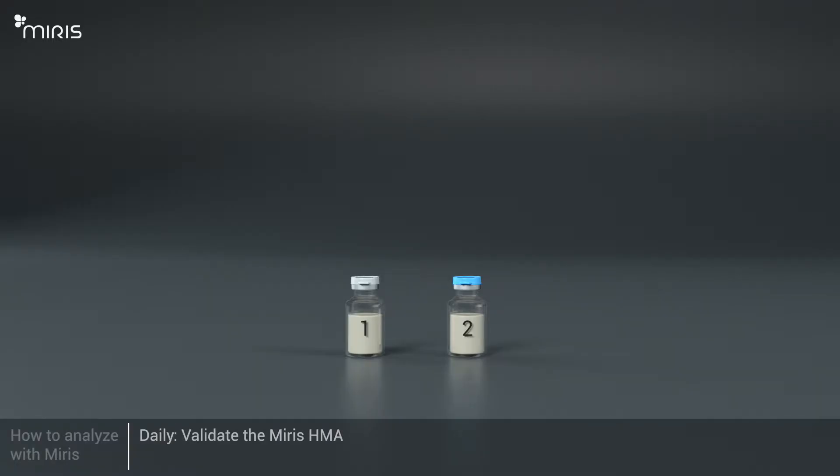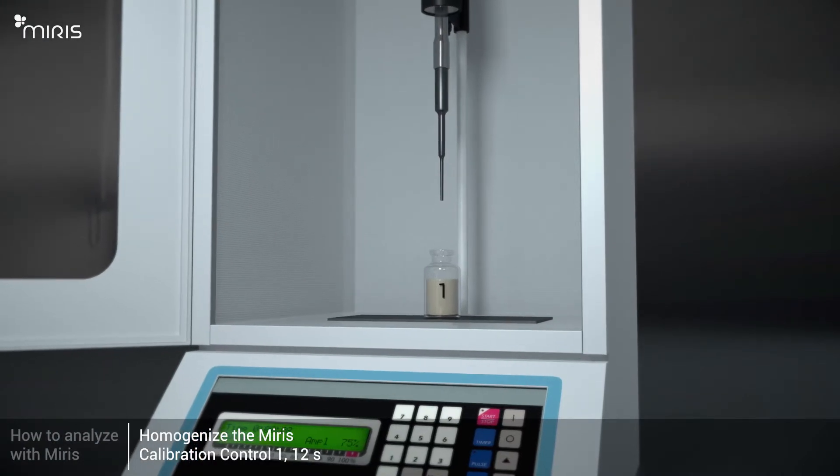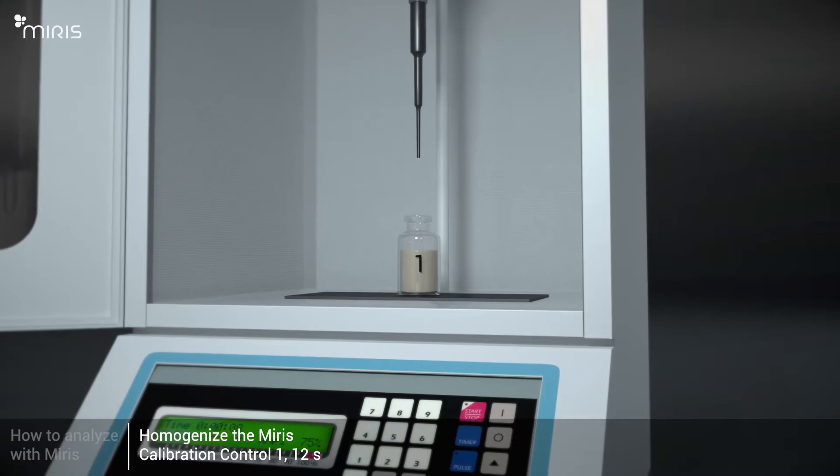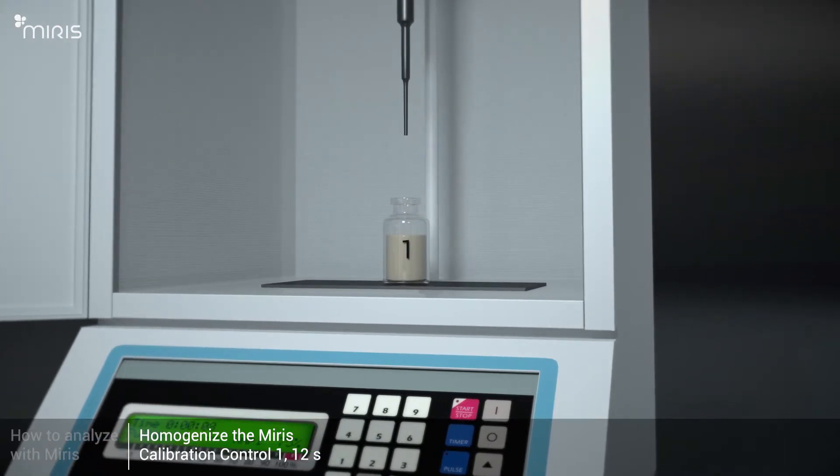Validate the Meris HMA with the solution Meris Calibration Control. This should be done as a daily control. Homogenise the Meris Calibration Control 1. Processing time is 12 seconds, 1.5 seconds per millilitre.